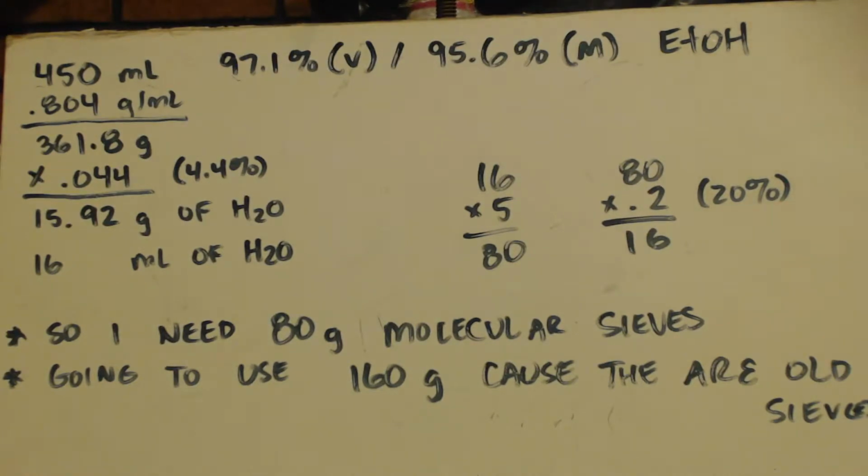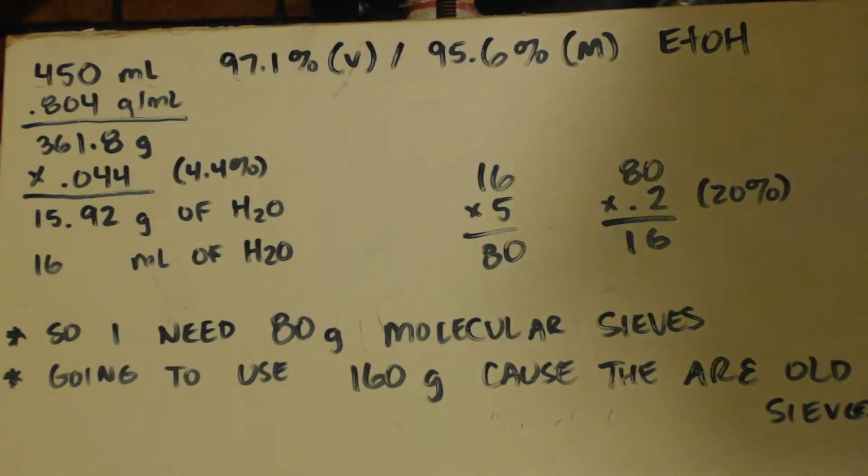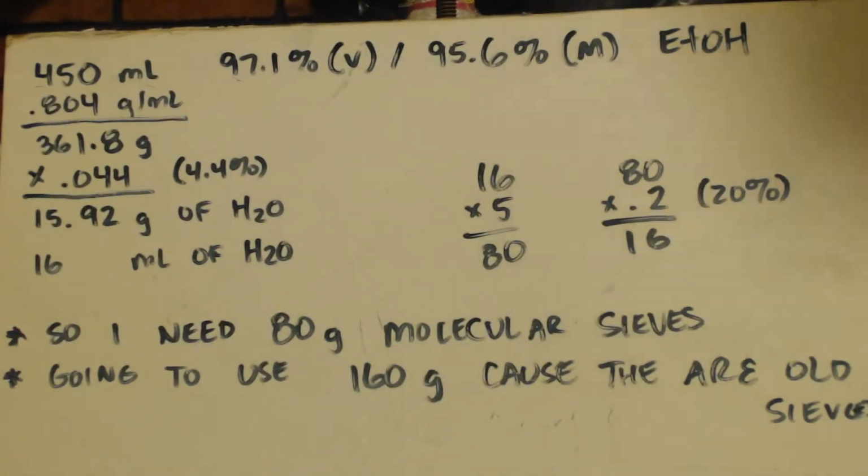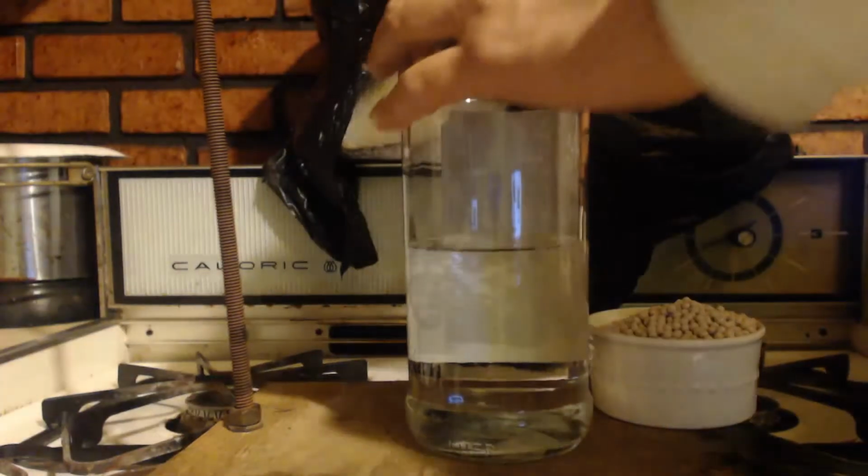Now I'm going to use 160 because these are old. They've been sitting there for 2-3 years and they've never been used. I've never regenerated them. I'm sure in the factory they soaked up some water while they were sitting there. They were in a plastic bag, so it's not like they, you know. So I'm going to add in 160 grams.